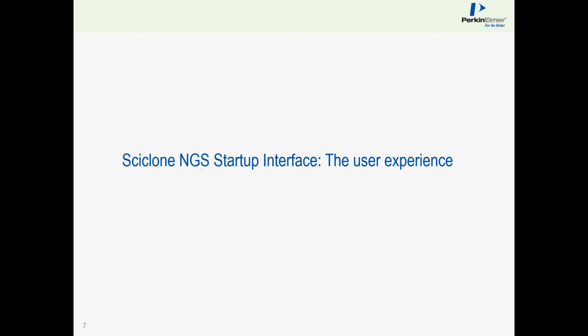Later on, I'll give you an intro to Maestro, the control software we use for the liquid handling instrument. We can create a sample method, and you can see just how easy it is to run the software, as well as to create custom applications on the fly if you need.